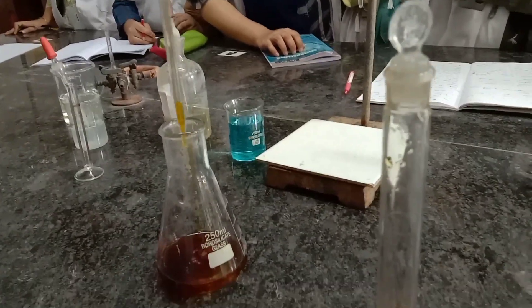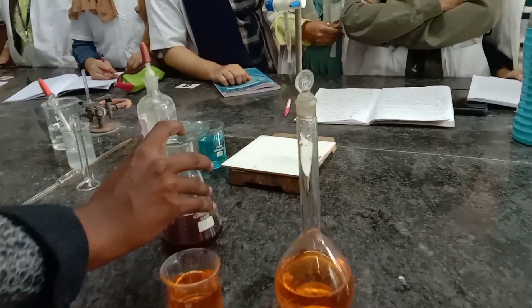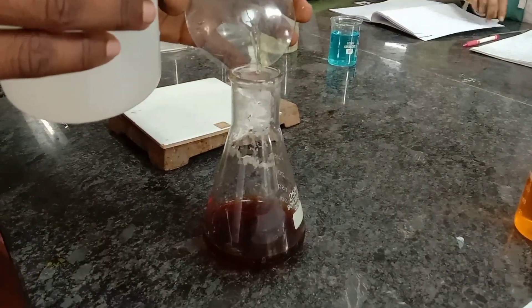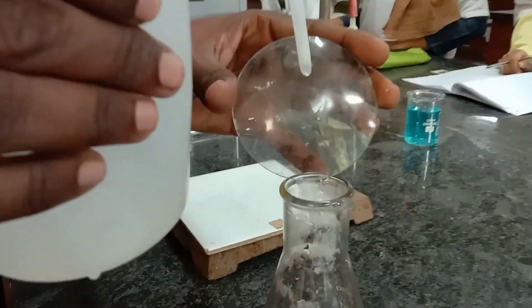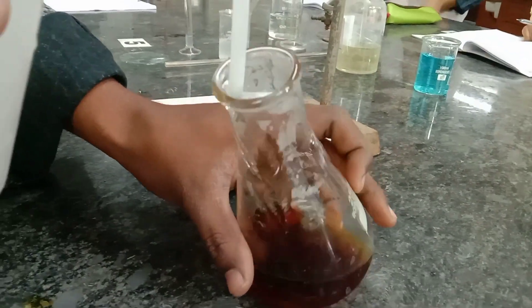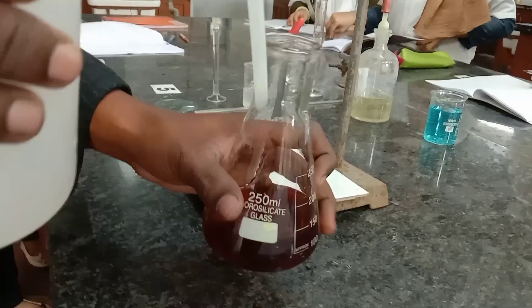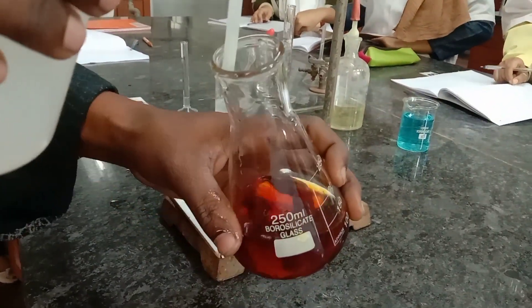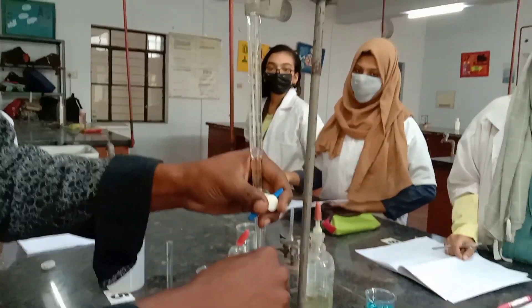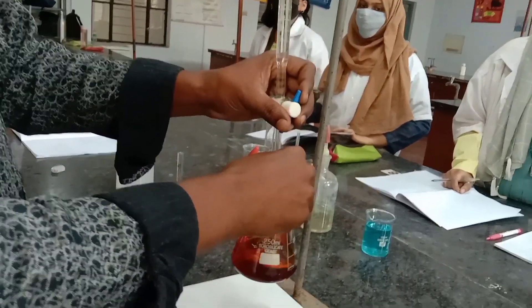We are not going to titrate immediately with hypo. Cover the flask with a watch glass and place it in a dark place for 5 to 10 minutes. After placing the conical flask in the dark for 10 minutes, take it out and wash the watch glass and also the walls of the conical flask. Then titrate against hypo taken in the burette.